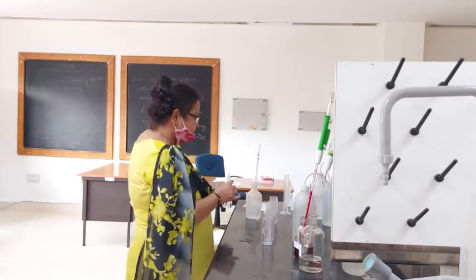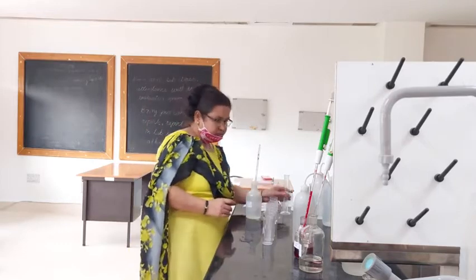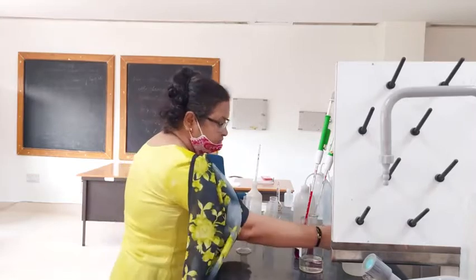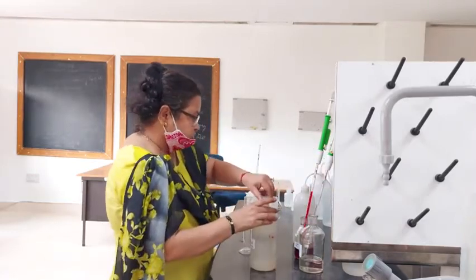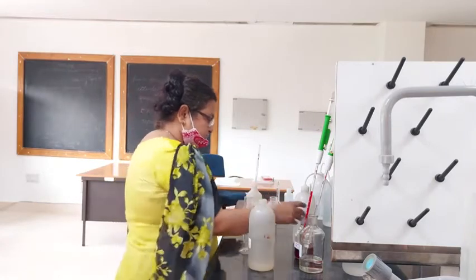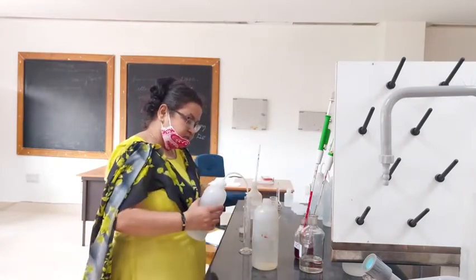Now I am going to measure 50 ml of all the samples. One is the river water. Before that, I have to rinse the measuring cylinder with distilled water.